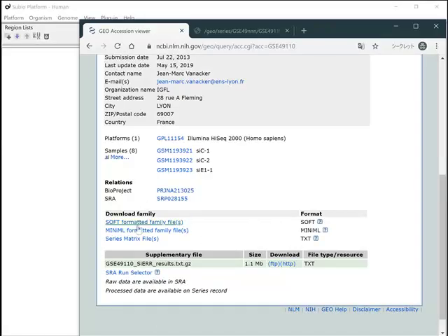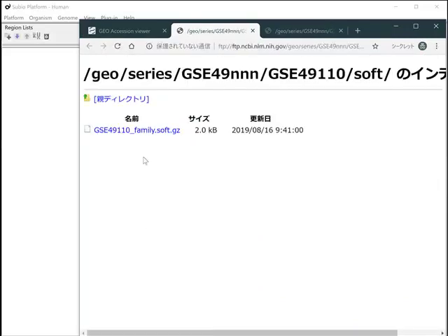Get the SOFT formatted family file from the GEO record. You don't need to uncompress it this time.